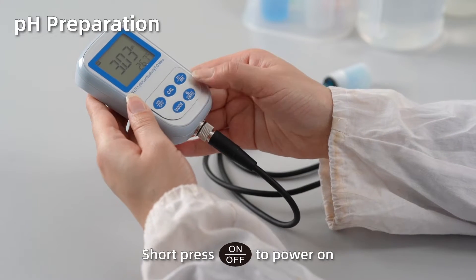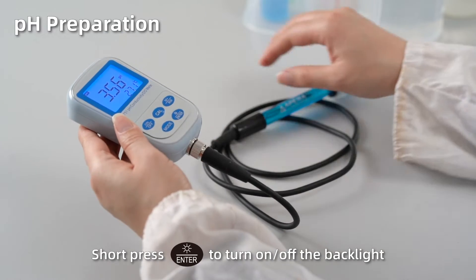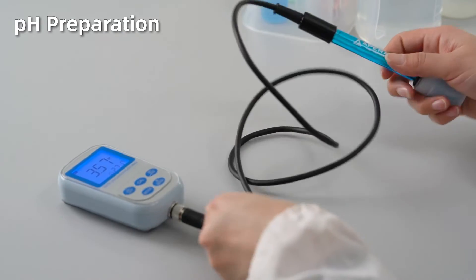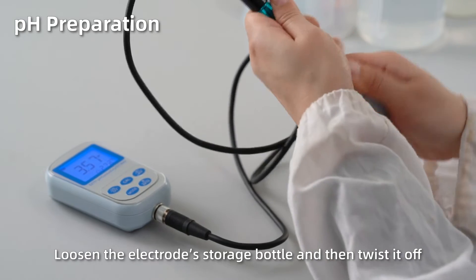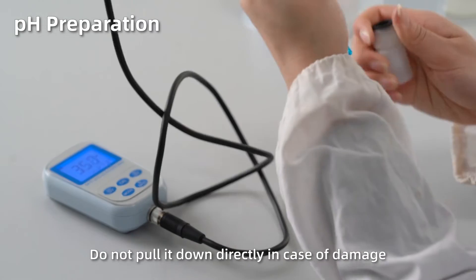Short press on to power on. Short press enter to turn on or turn off the backlight. Loosen the electrode storage bottle and then twist it off. Do not pull it down directly in case of damage.